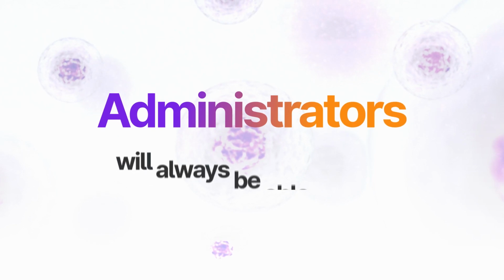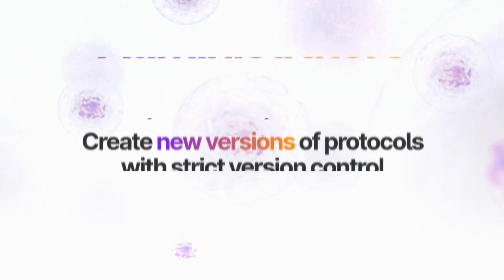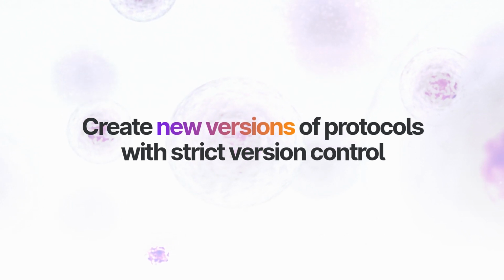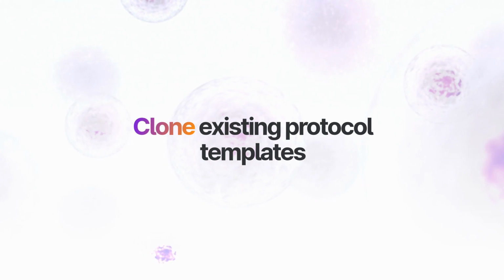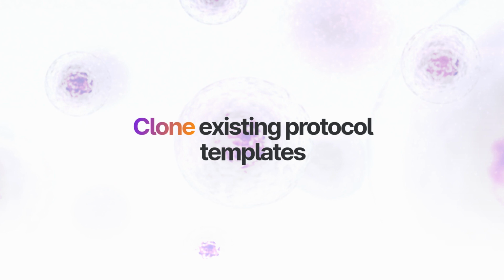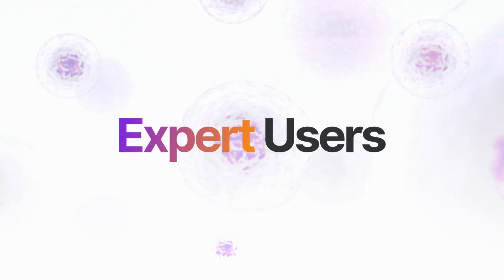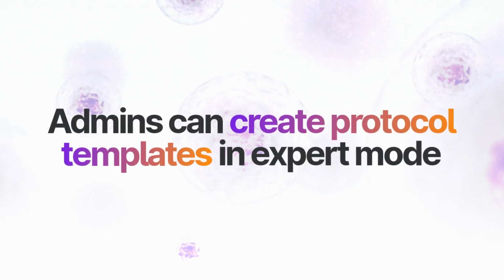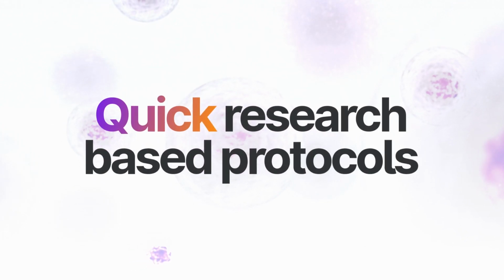Your administrators will always be able to keep your protocols up to date, with the ability to create new versions of protocols with strict version control, or they can clone existing protocol templates to quickly adapt them to new cell lines or experiments. Also, if you have expert users who want a faster user experience for entering data, your admins can choose to create protocol templates in expert mode, which streamlines the process for quick, research-based protocols run by your most skilled team members.